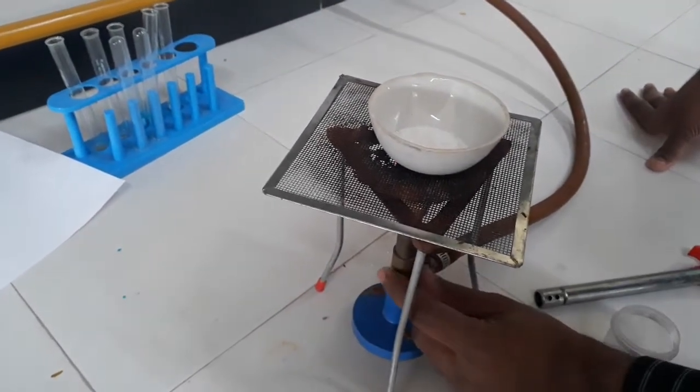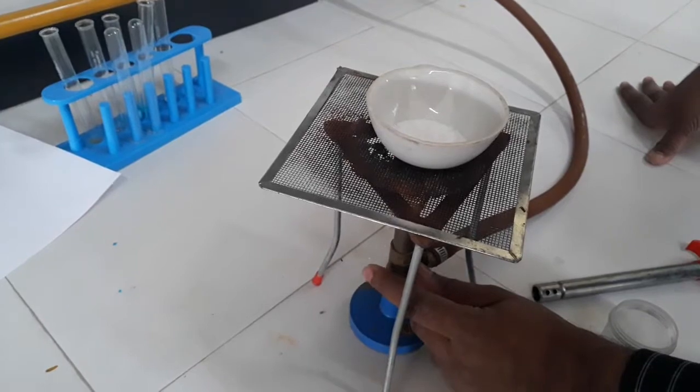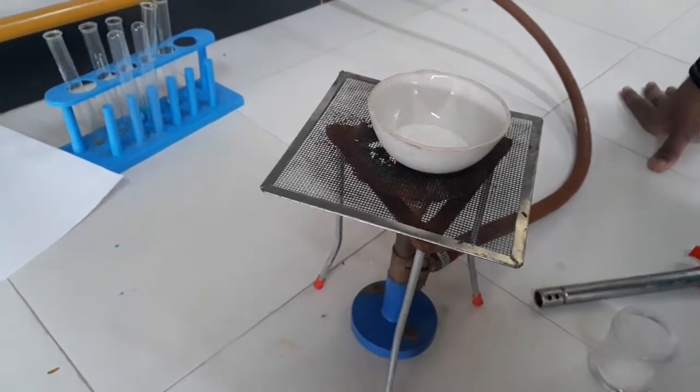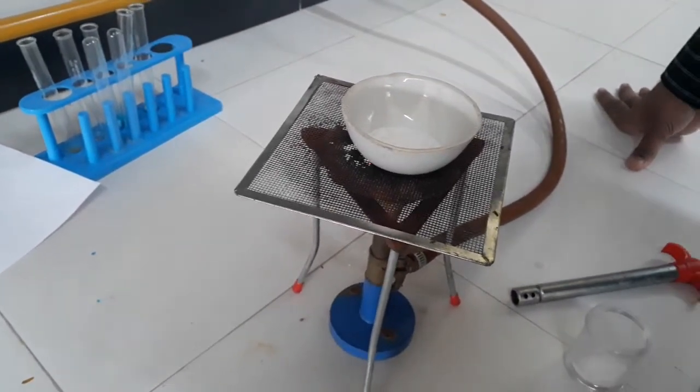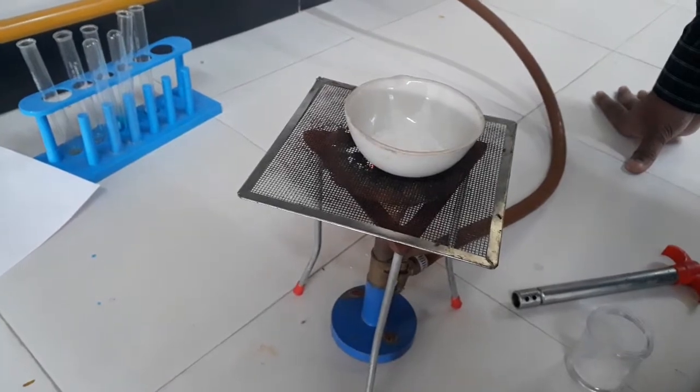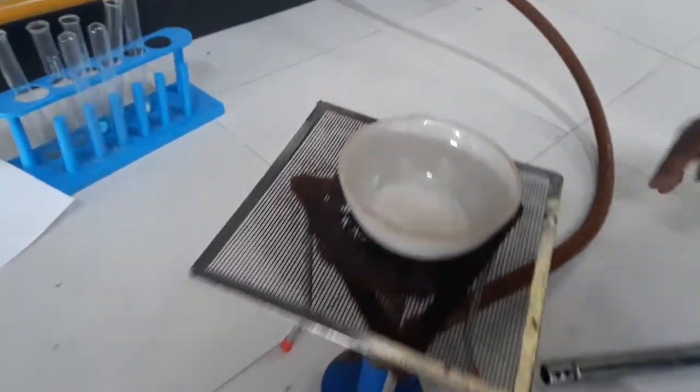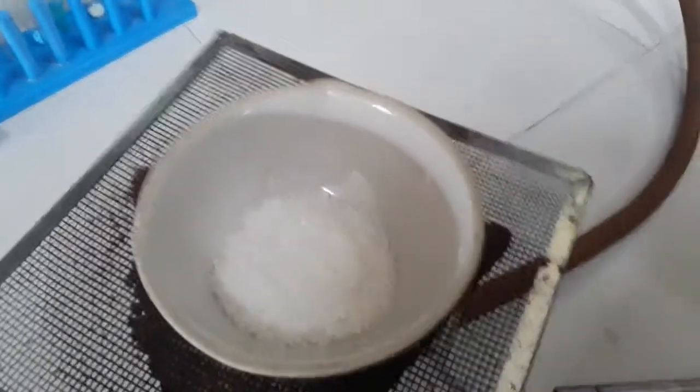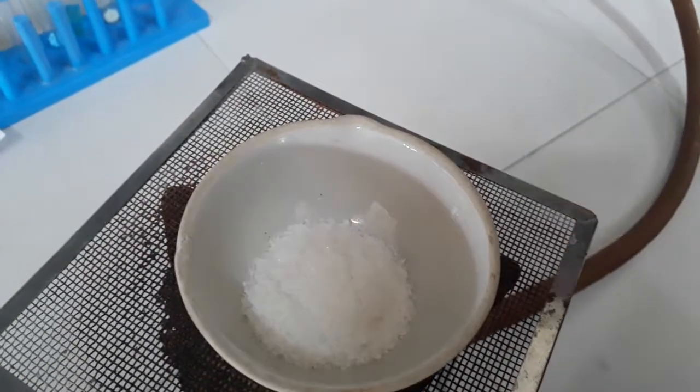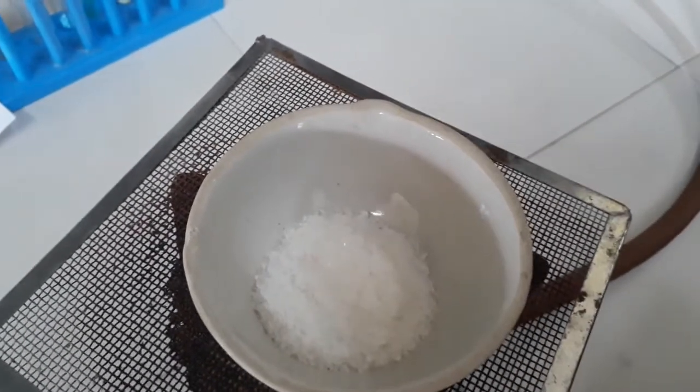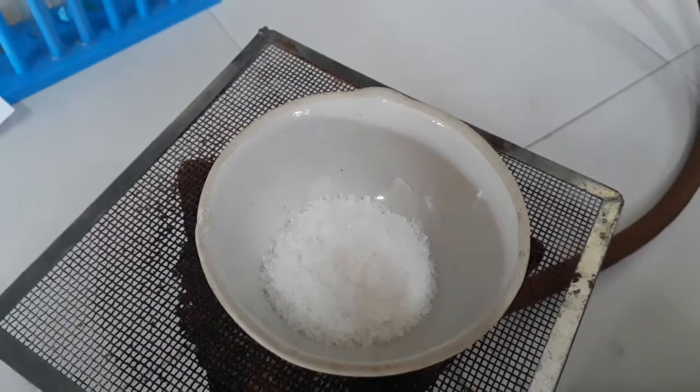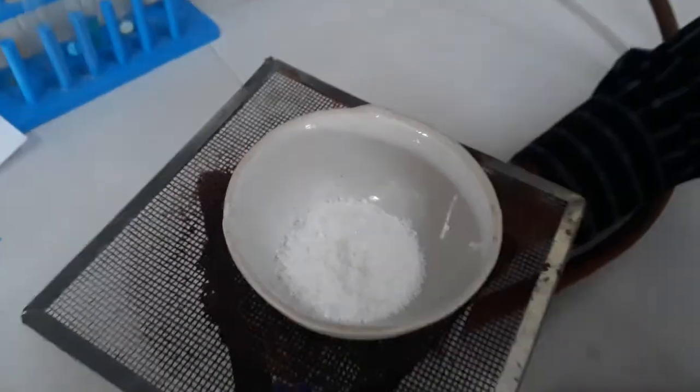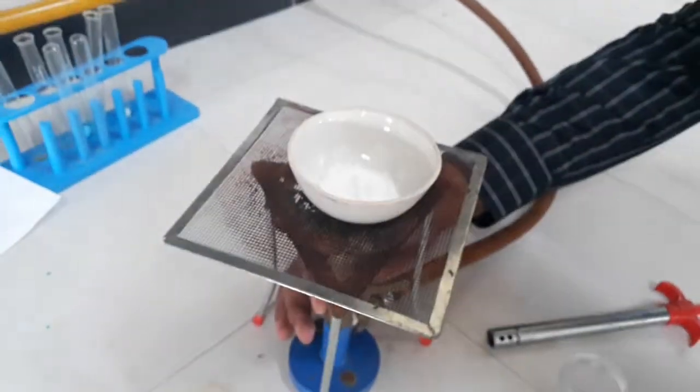Now you can see the color of the substance, or you can see some shiny color on top of it. This is due to melting of alum, and when it is getting more and more heat, more and more water molecules will be released.